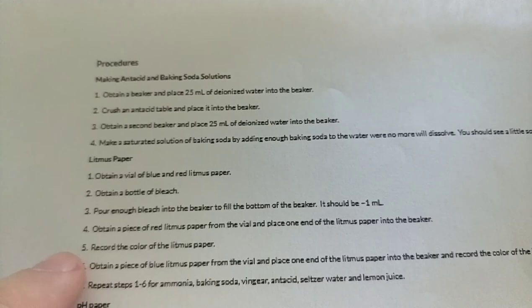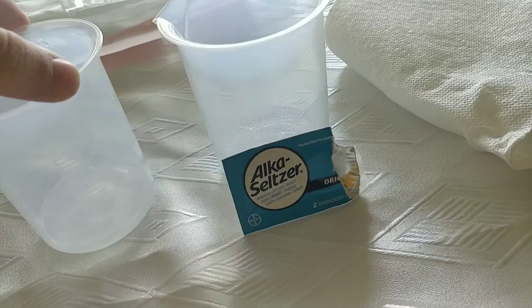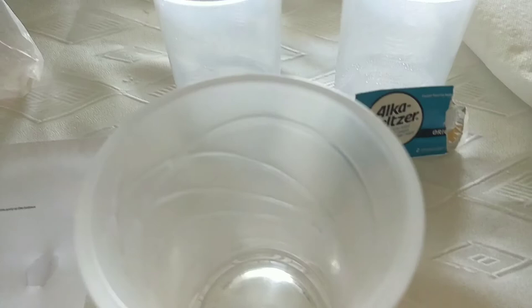Now I'll move on to creating the other solutions and then testing them with the litmus paper. I have my blue and red litmus paper with a couple strips of each. I'll be starting with the Alka-Seltzer and antacid solutions since I have them in the beakers. To measure one milliliter I have a syringe, and I'll put it in this cup since I don't have a third beaker. I'll measure one milliliter and test it with these two pieces of litmus paper.